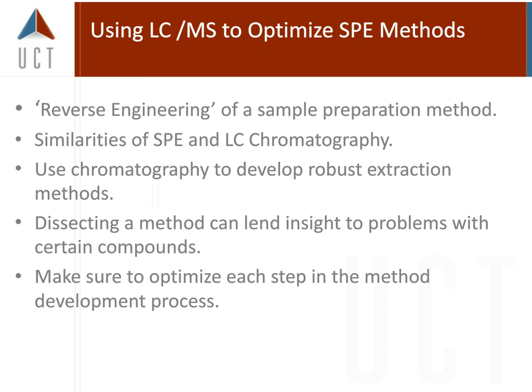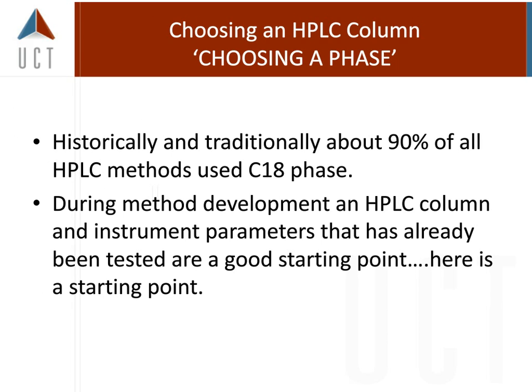When we talk about the phases of solid phase extraction, we usually have mixed mode. C18 are the most common. When I say mixed mode, those are phases that have ion exchange as well as reverse phase.